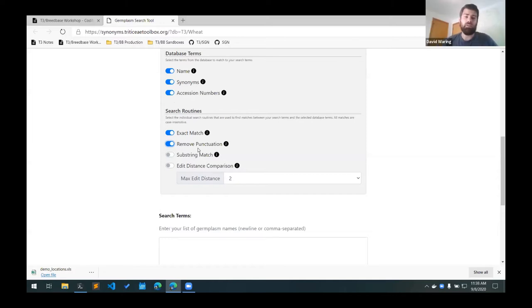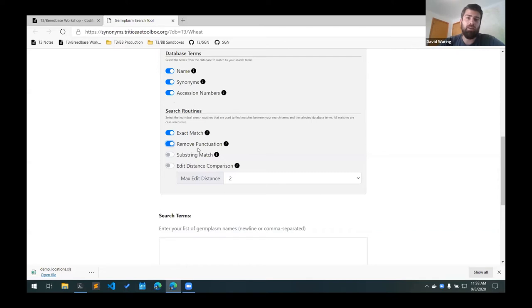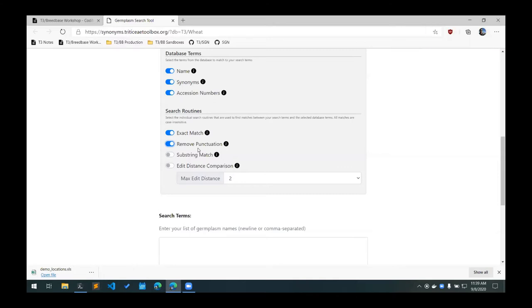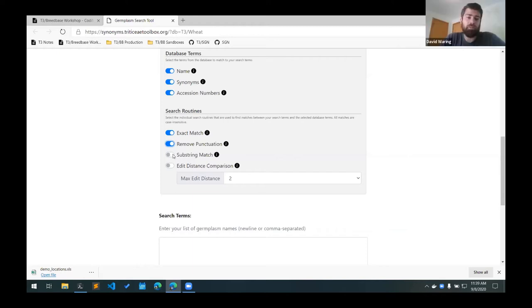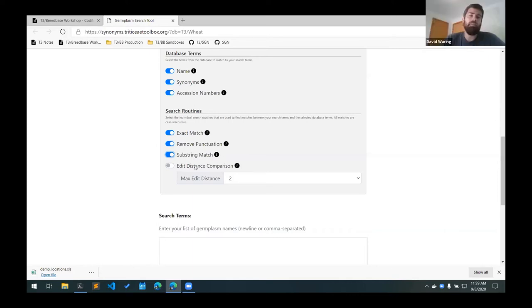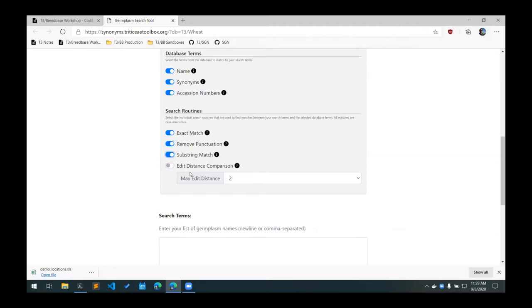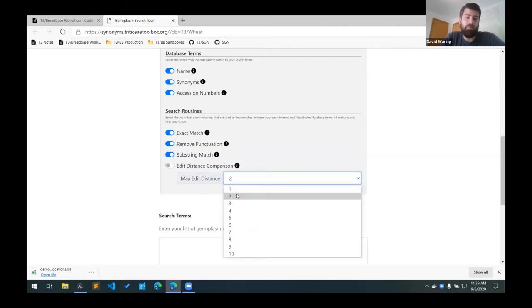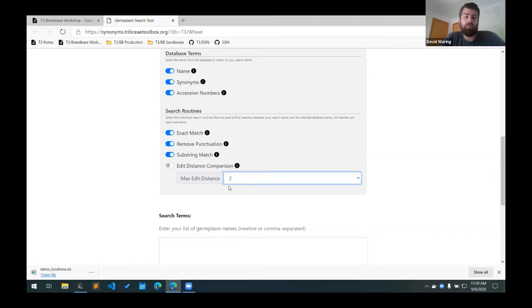This is helpful if you use a dash as a delimiter, but someone else just uses a space or an underscore. This will still try to match your term up with a matching database term. The substring match search routine will check to see if your search term is a part of another database term. And then there's an edit distance comparison which will find matches that are up to a maximum of the selected max here. So in this case up to two differences in characters or insertions or deletions.